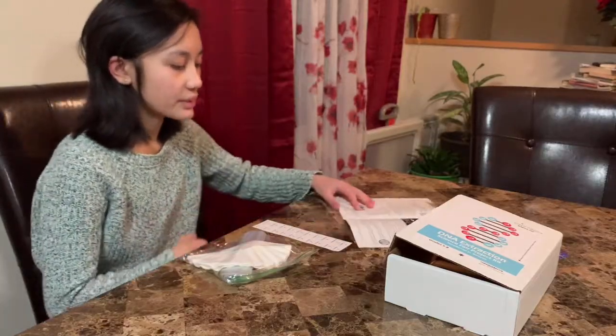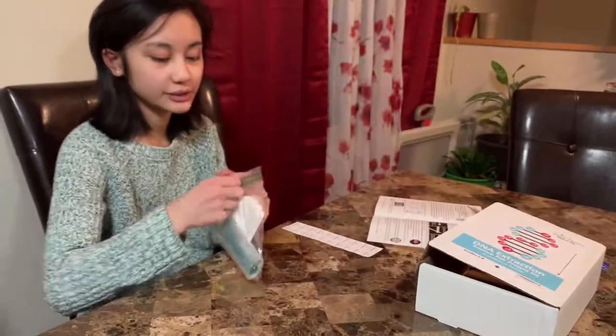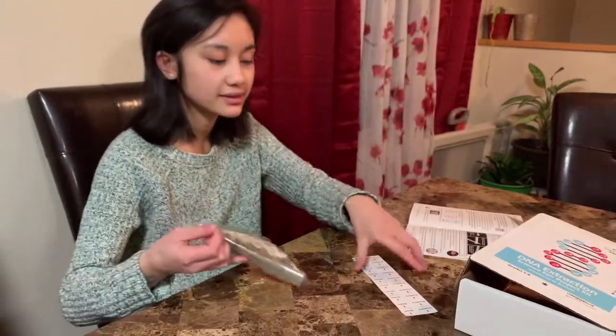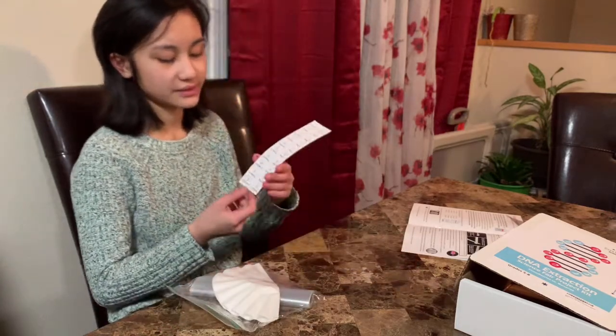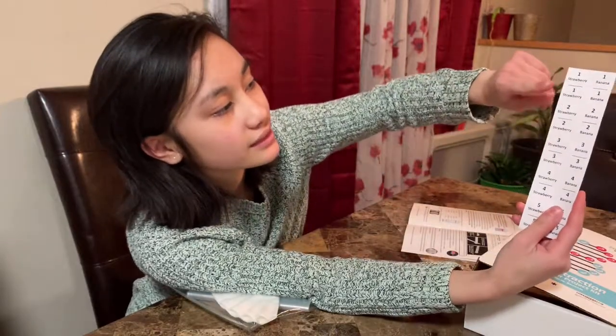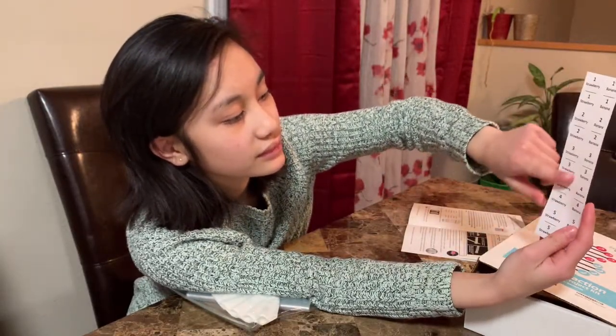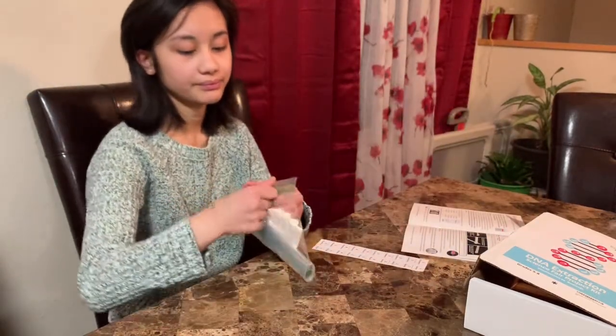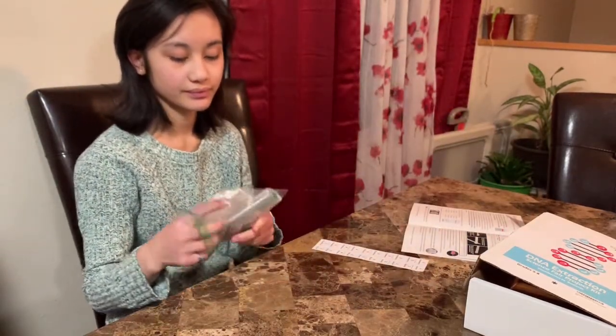So the first step is we're going to take the bags and our labels, and we're going to label the bags. And there's 10 bags. So each has these labels with it. There should be 10. Here's our bags.